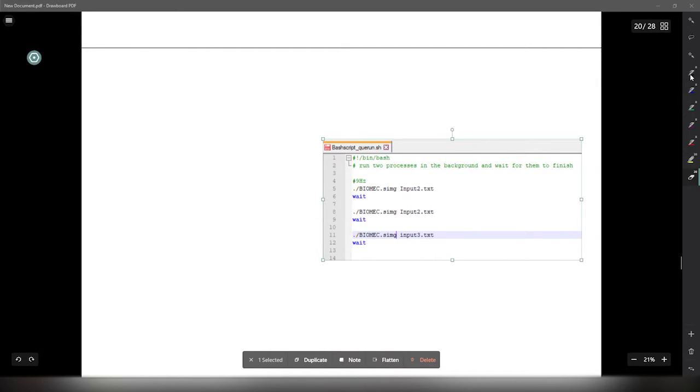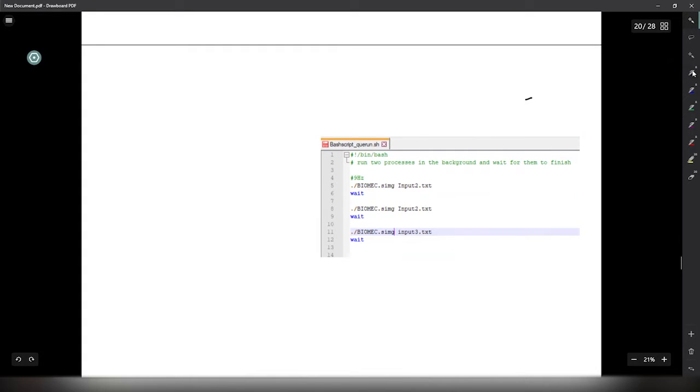Okay, so because we're going to be running a lot of these MECSim or CMA-ES, instead of just sitting at your computer waiting for like 10 minutes for CMA-ES to finish and then running another one, or for BIOMEC waiting there for 4 hours, you can just queue it all to run using a bash command like so. So what this will do, I don't think the wait is 100% required, but it is required for supercomputers. You just submit a bash command file with this here.